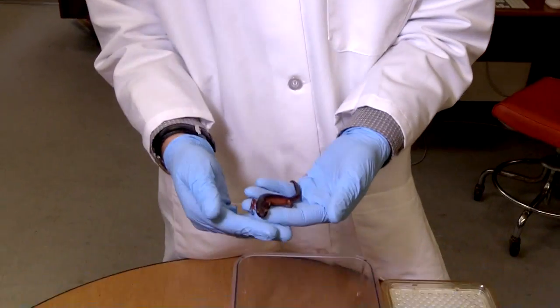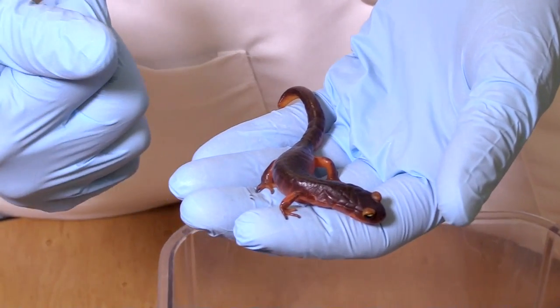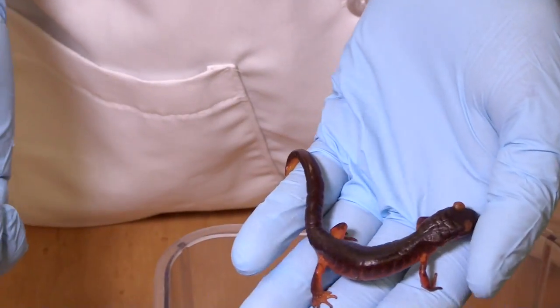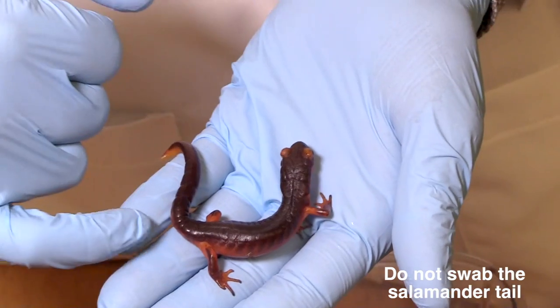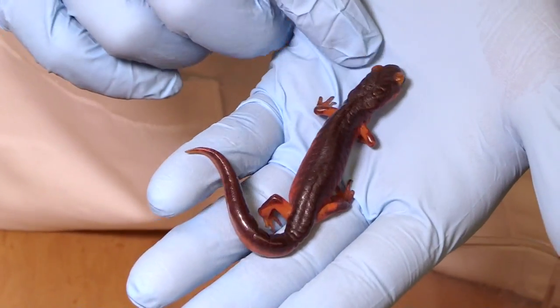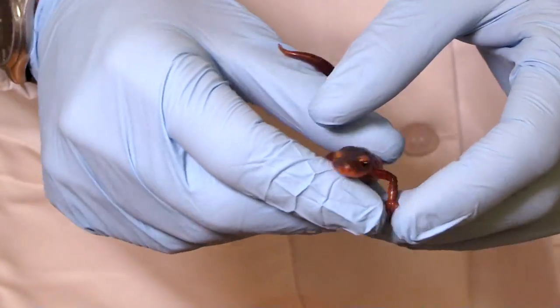One thing to be aware of with salamanders is that when you're handling them, you have to be really gentle because they can actually autotomize their tails as a defense mechanism against predators. So we don't want them to lose their tails from the sampling techniques. You can see right there where they can do it, at the constriction at the base of the tail. They have special muscles that pinch off the tail, and they don't even bleed when they do that.